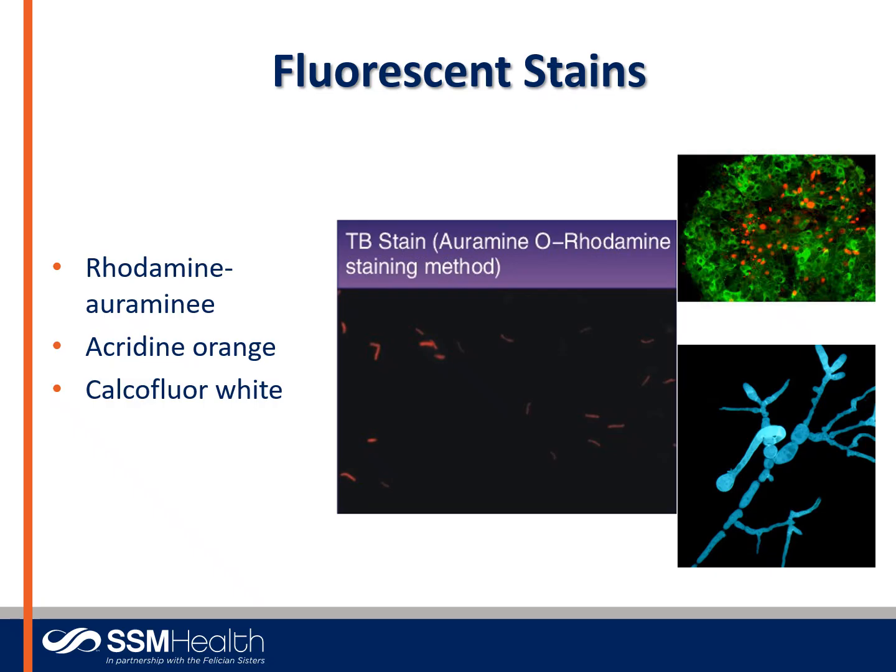Particularly if a blood culture goes positive on the instrumentation but we are unable to see organisms growing, acridine orange is a good follow-up, just to see if there's any nucleic acid that is staining. It is non-specific, so it will bind to any nucleic acid, including host cells.